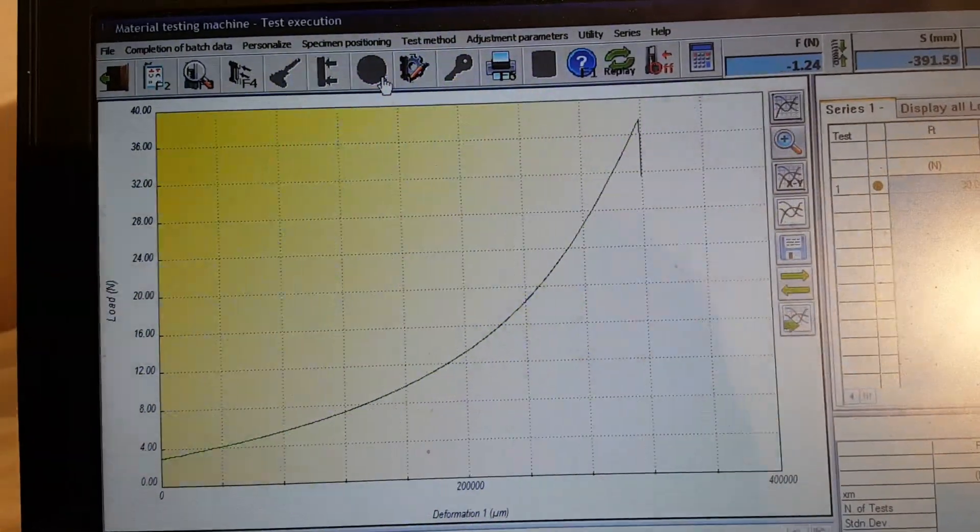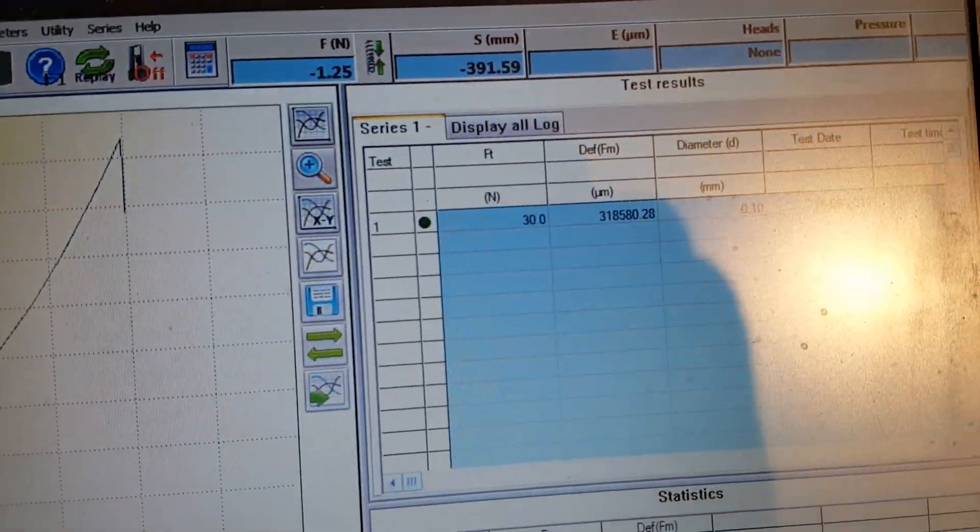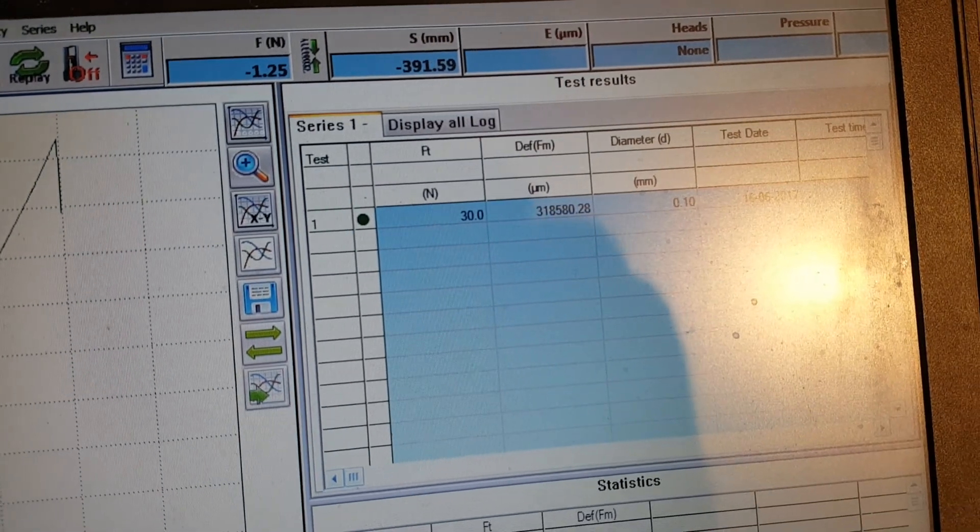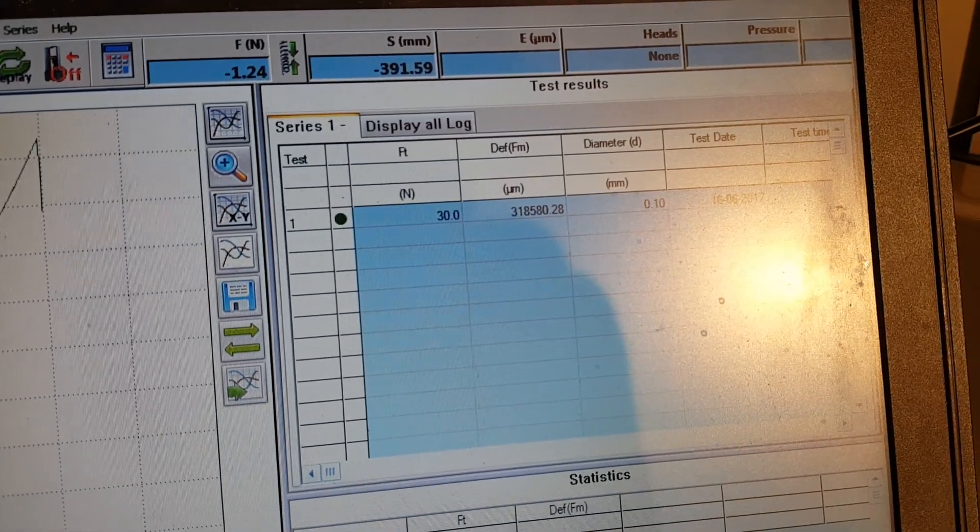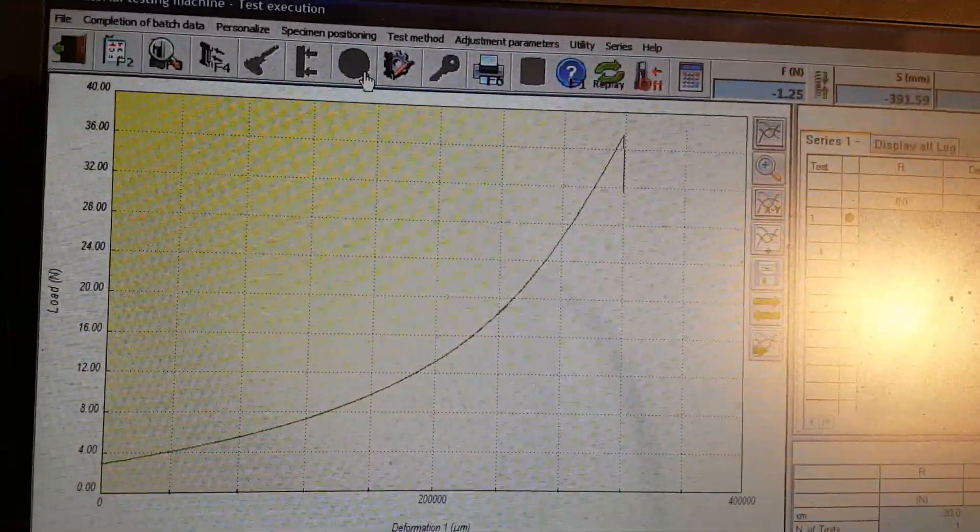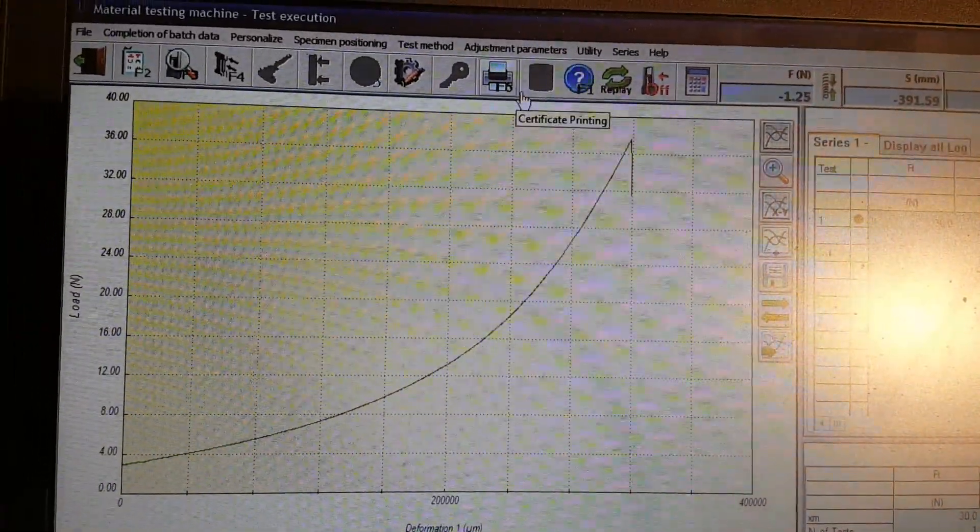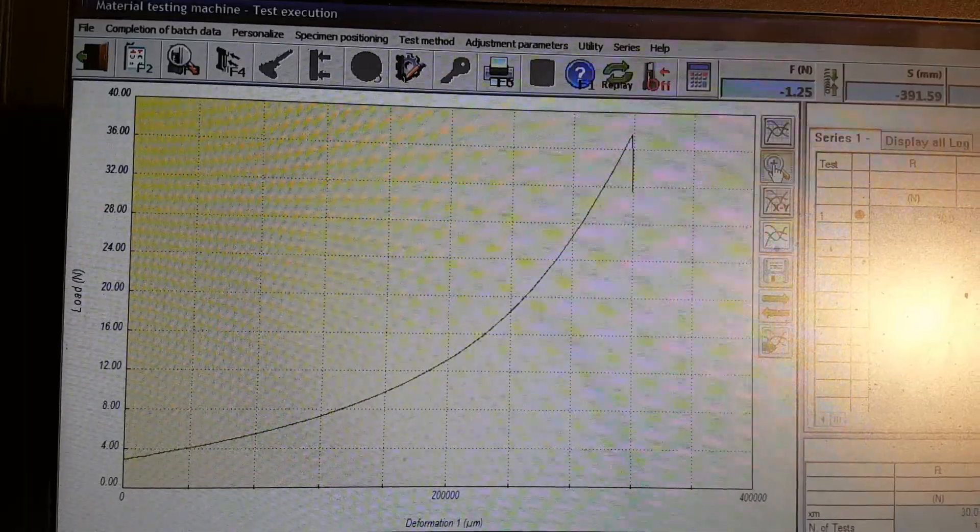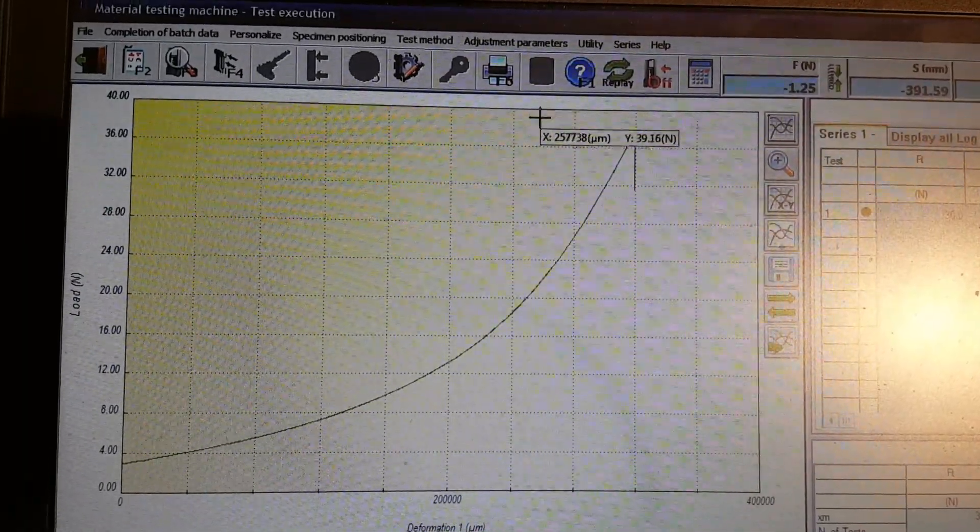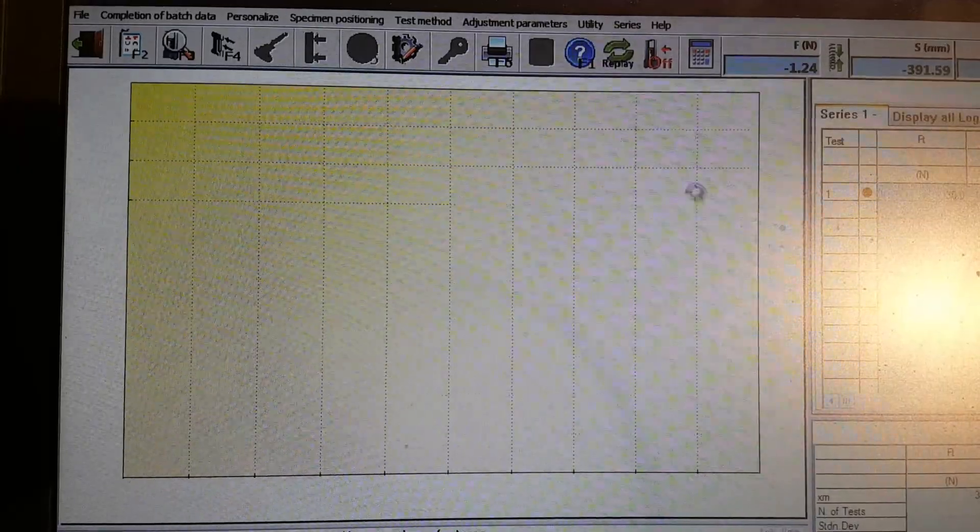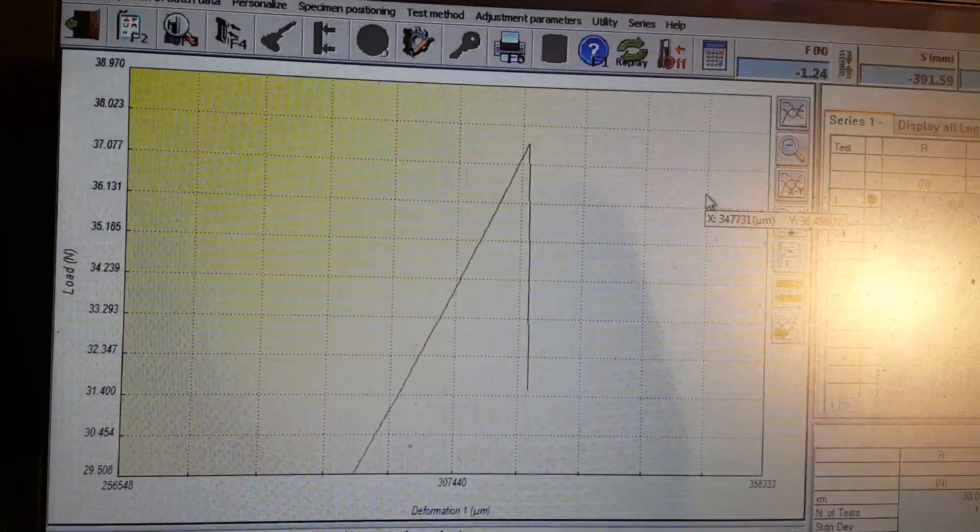Let's go ahead and look at our results. This is the peak here, you can see it went up to right exactly at 30 Newtons. We also have the deformation in micrometers. I can go ahead and change the units, and we can also zoom in on the specific area.